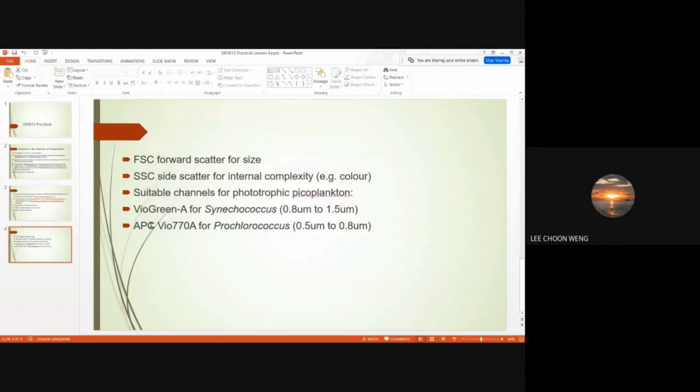Whereas a high-end can easily go up to 500,000, and that one can have 6 channels. 6 channels means you have different lasers and different filters, so you can cover a lot of different colors. So you can use more fluorochromes, different kinds of fluorochromes.